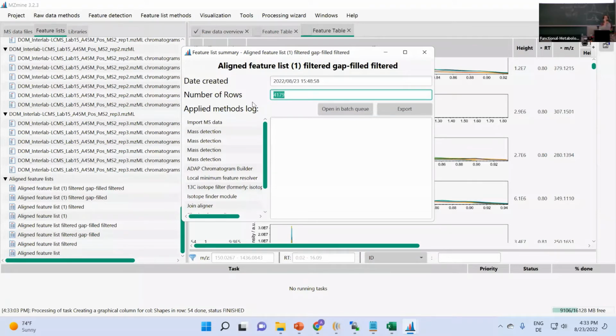So yeah, that could be an indicator, because those samples were the same, right? And I think all of the instruments that made it into that data set performed well. But that could be simply due to the fact that the threshold you've set there was a little bit too high. So rerunning it with a lower threshold might bring up that feature.